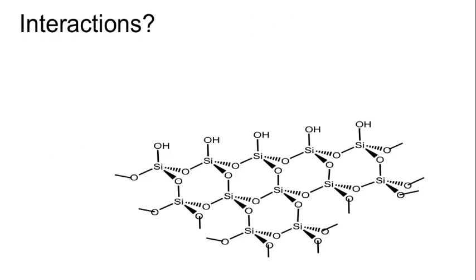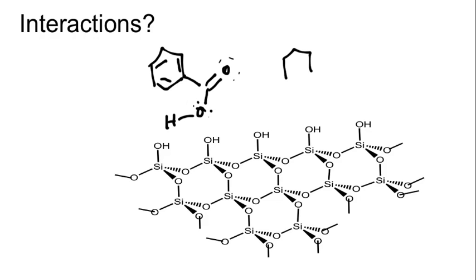So let's take a look now just at our silica. We'll attempt to simplify things here, and we're going to draw on 2 compounds. Okay, we're going to look at benzoic acid. So we'll draw this on here. We've got the benzene ring followed by our acid functional group. Okay, and I've always said that we need to draw on our lone pairs, so let me go ahead and do that so we can see them all. There are lone pairs on our oxygen. So we've got benzoic acid, and I'm also going to draw a second structure. This structure we'll draw out as naphthalene.